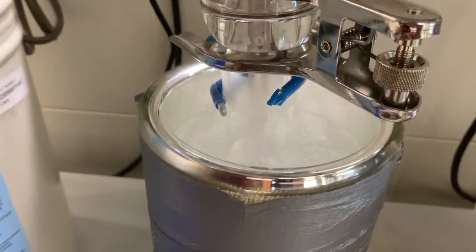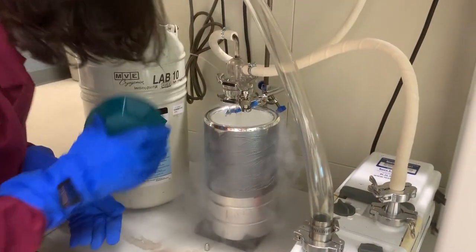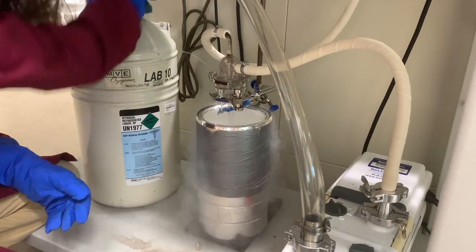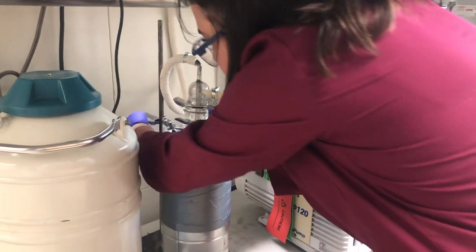As you work your vacuum in the glove box or on the Schlenk manifold, continue to monitor the level of liquid nitrogen and refill as necessary to maintain that level. Once you're done with the vacuum, it's time to take it back apart again.